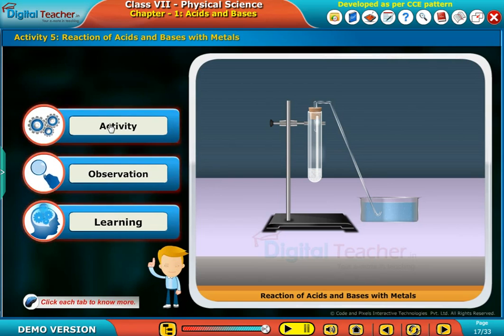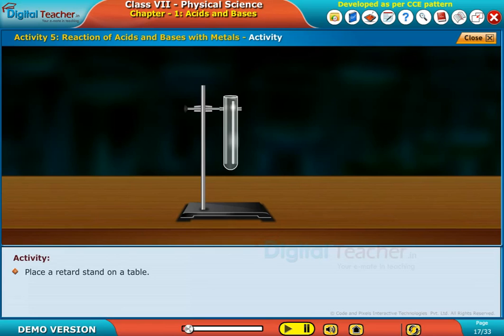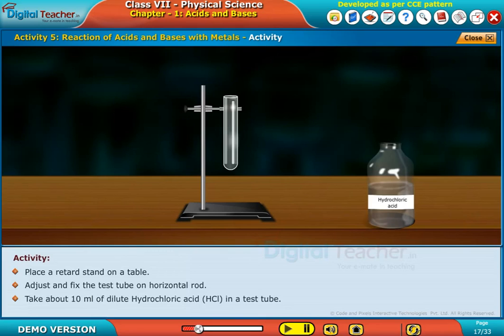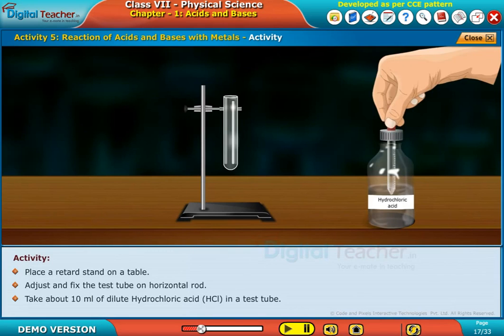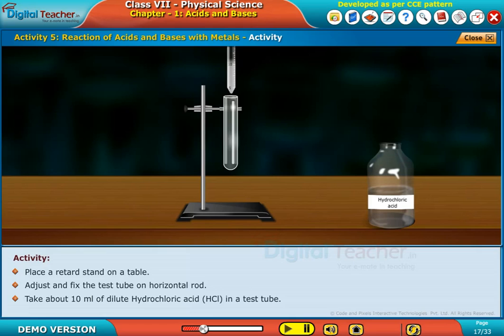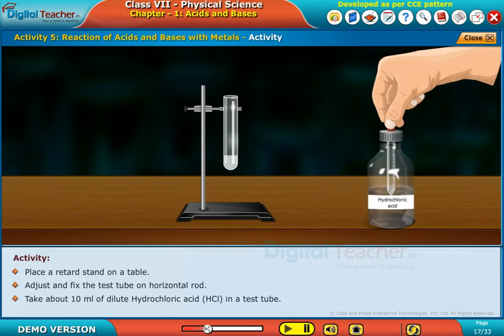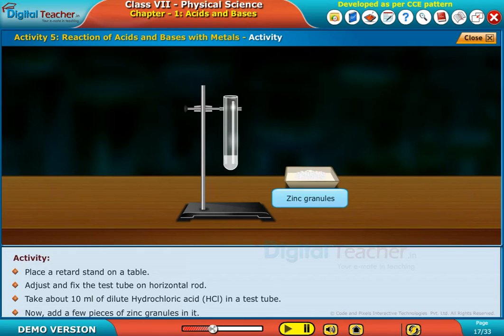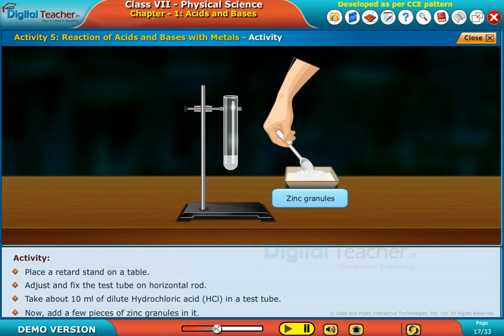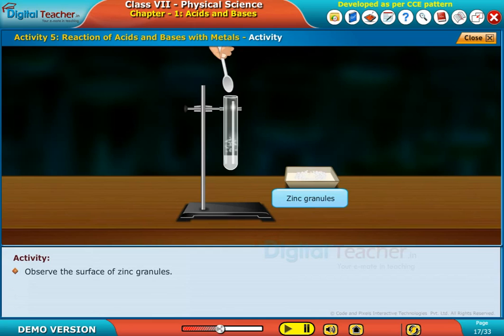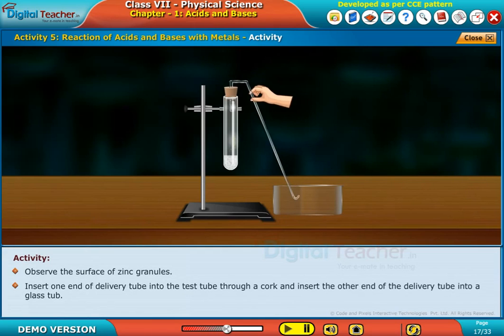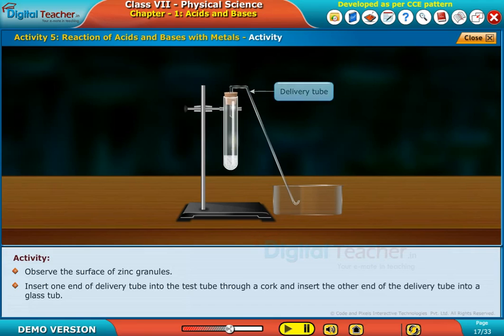Place a retort stand on a table, adjust and fix the test tube on the horizontal rod. Take about 10 ml of dilute hydrochloric acid (HCl) in a test tube. Now add a few pieces of zinc granules into it and observe the surface of the zinc granules.